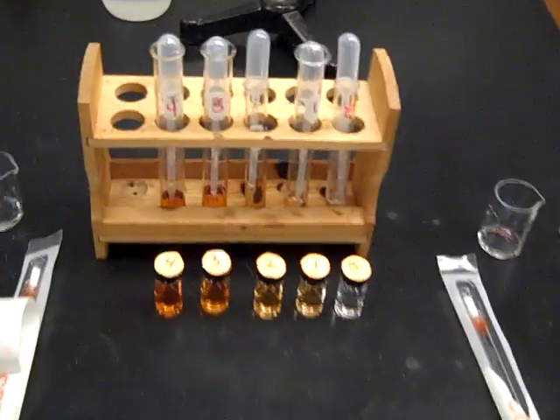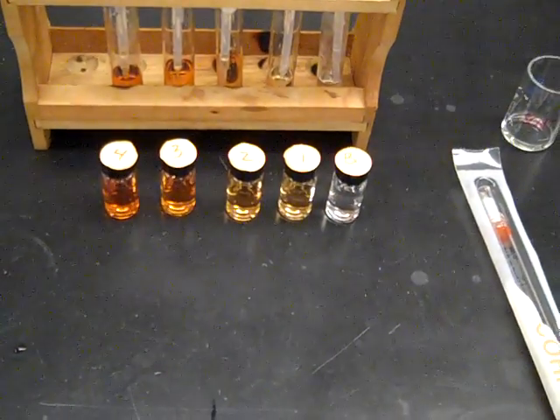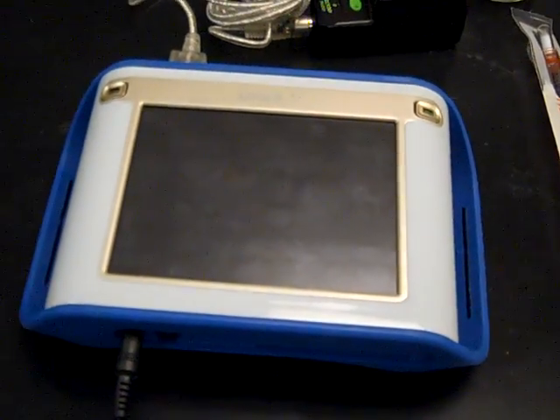We have the test tube rack with five test tubes in it. We have five cuvettes which we would be using in our colorimeter, and that is attached to the spark.